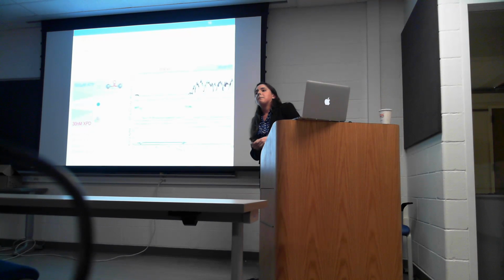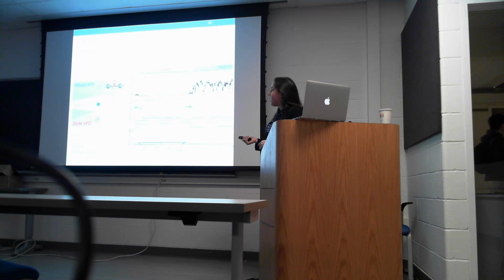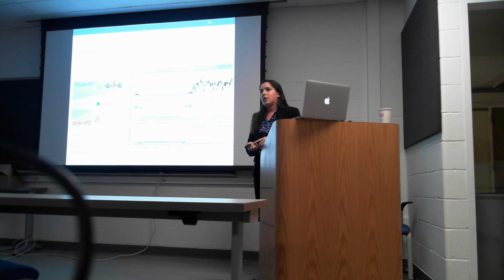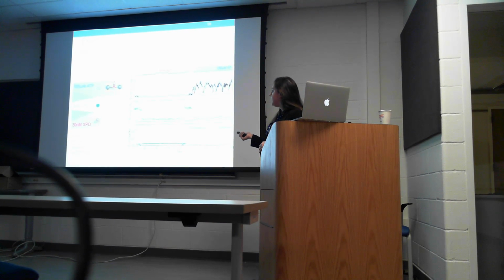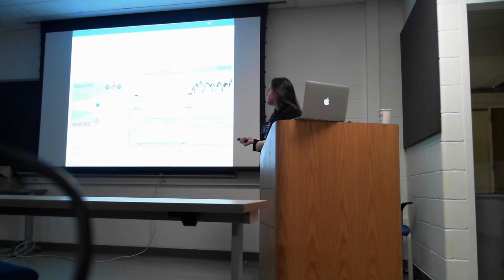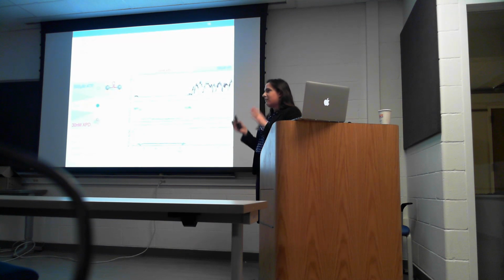So how fast do you move it across the chamber? From the bottom to the top takes about 10 seconds, 10 to 15. It's like instantaneous. So the changing of the buffer conditions is instantaneous. Moving from where we have XPD to where we have ATP is the duration of this green chunk, which is about 10 seconds. So changing of conditions is very fast.